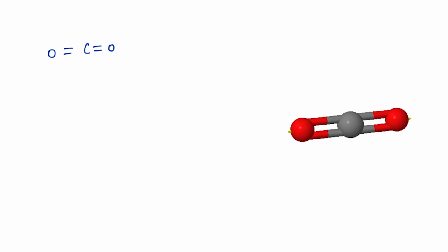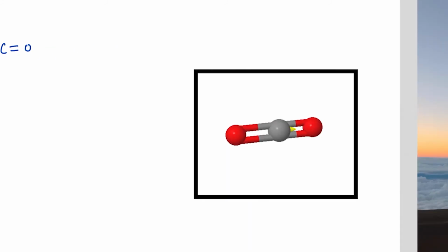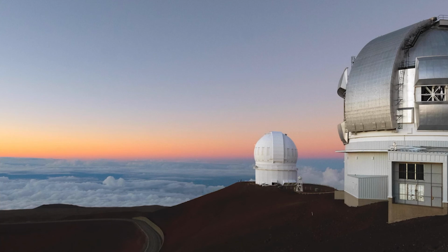Again, it has the ability to show symmetrical stretching, asymmetrical stretching, and also bending.